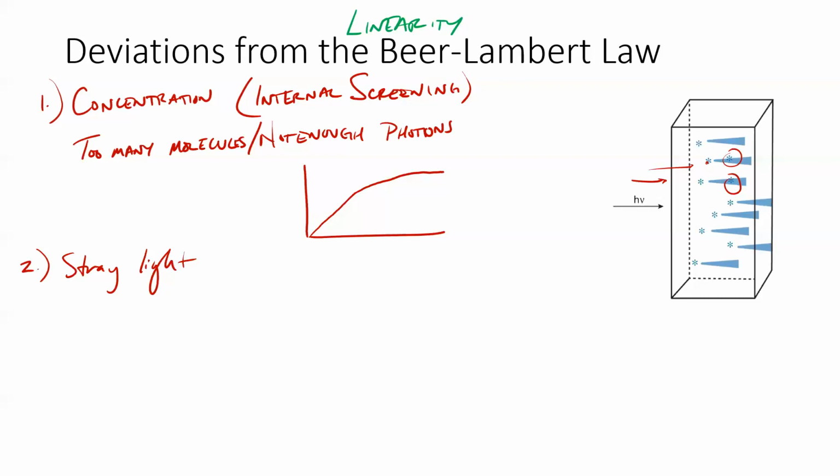So just for sake of argument, imagine that the room light is 1 watt, right? That's stray light. If you let 1 watt into a 50-watt bulb, that's an extra 2%. If you let 1 watt into a 7-watt bulb, that's an extra 12.5%, right? And so the more powerful bulb you use, the less stray light really matters, right?